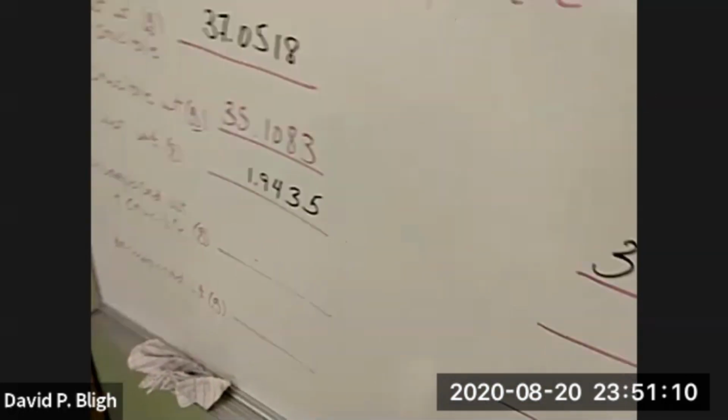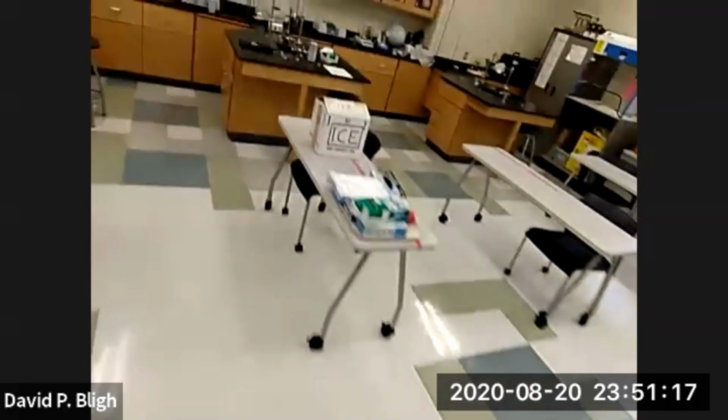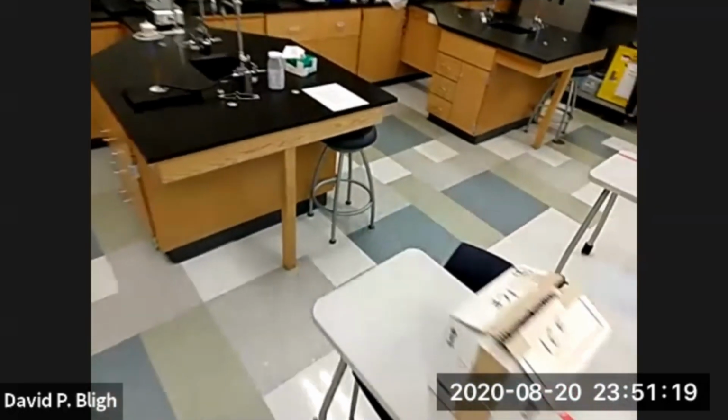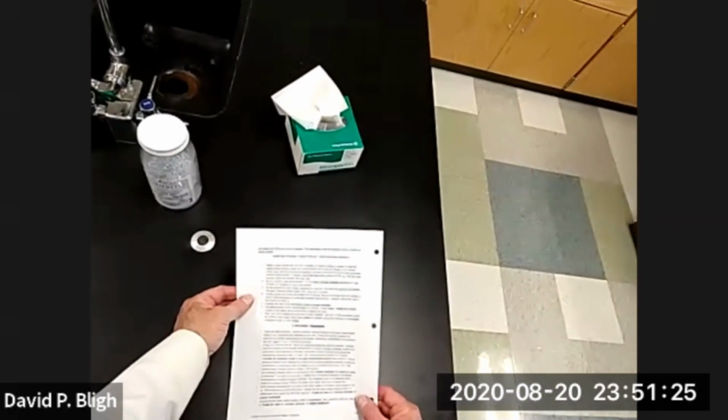All right. Now we can, while we're waiting, measure out the sodium hydrogen carbonate. And let's see, what are they expecting? I think it's about 2.5 grams, if I remember correctly. Yes, 2.5 grams.